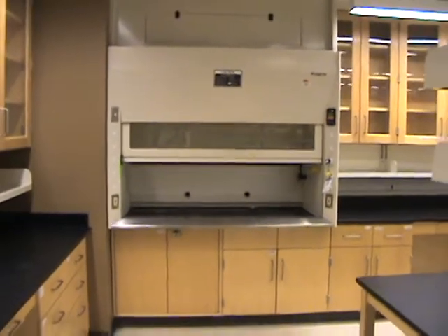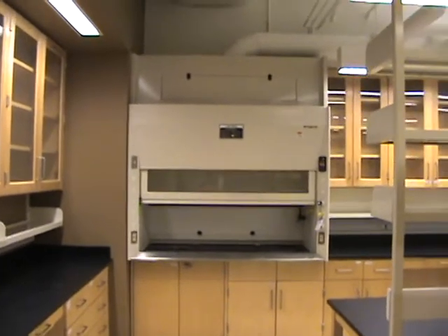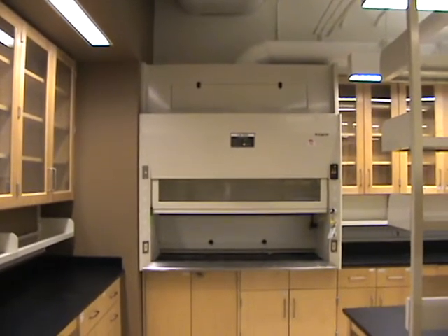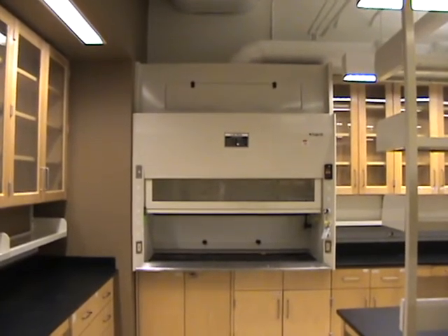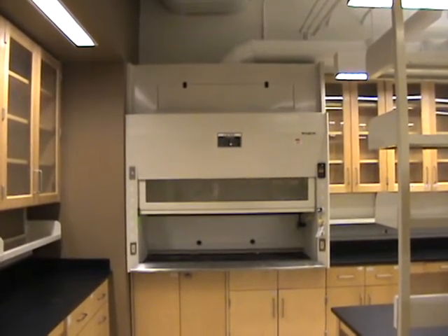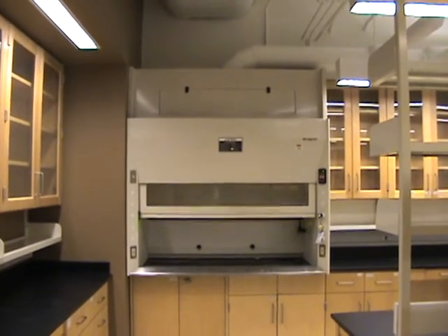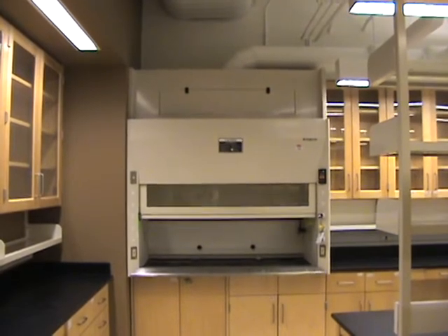These hoods can cost anywhere from five to eight thousand dollars depending on whether it's a six-foot or an eight-foot hood, and the installation cost can run another five to ten thousand dollars. A completely installed hood will require an electrician, a sheet metal contractor, and a plumber — several trades. It may cost anywhere from eight to twelve thousand dollars to get the thing installed.